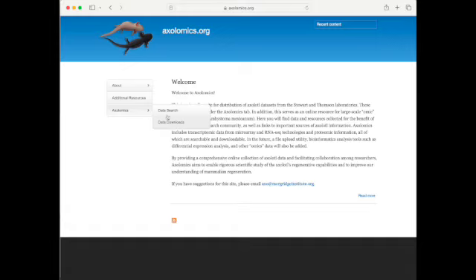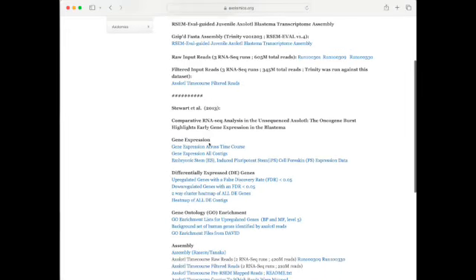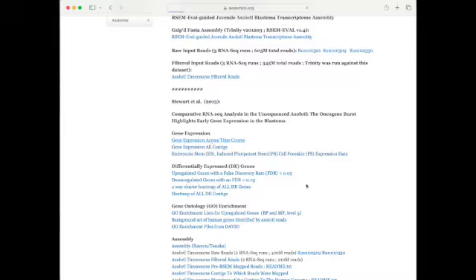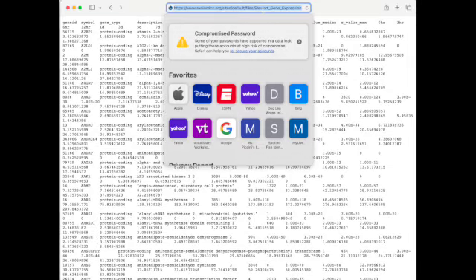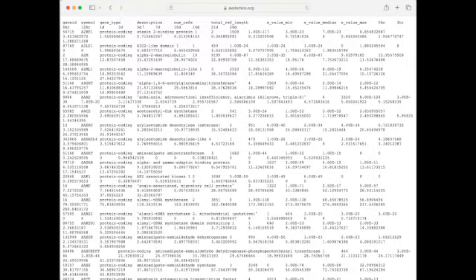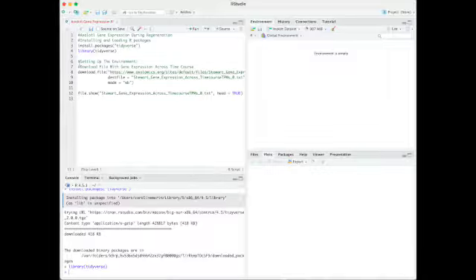This was created by Stewart and Thompson Laboratories to upload supplemental axolotl data. Here we can retrieve the data we will use in R by going under the tab and clicking here, then pasting the link into R. Now we can upload the data directly into R using download.file to download the information from the URL given. file.show allows us to see the text file within the R environment.